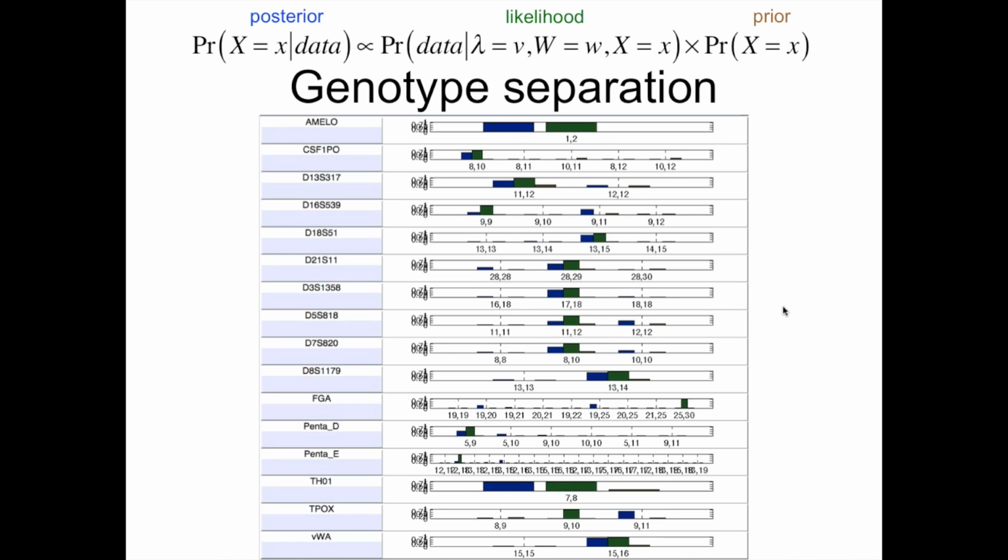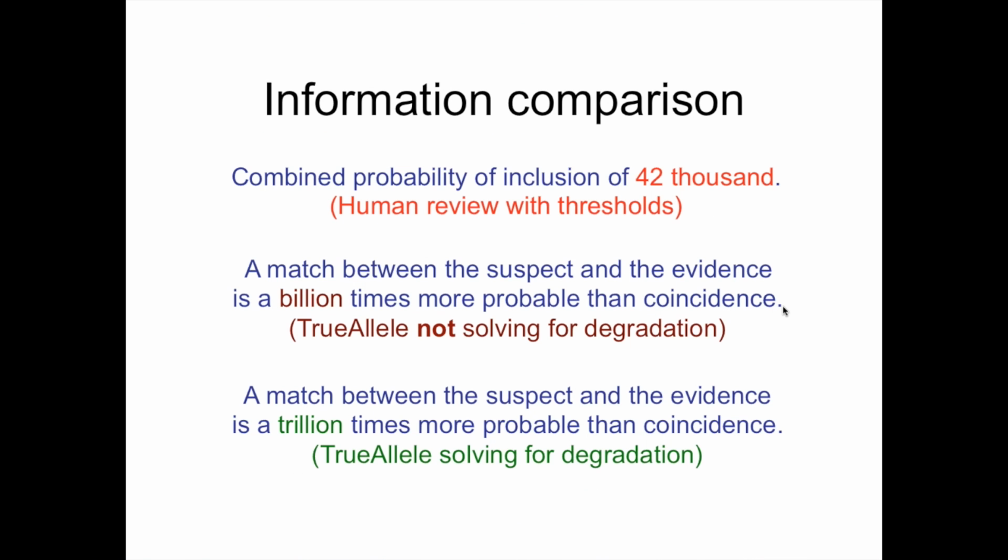So what we see is that at most of the loci here, the computer has correctly concentrated the probability of this degraded 30% contributor, as shown by the blue probability distribution, next to when a comparison was made after that objective determination, next to the genotype shown in green of the suspect. Now, when that objective genotype was formed, different methods were used.